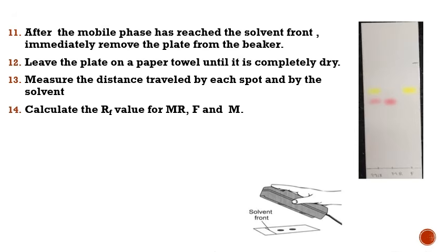Measure the distance traveled by each spot and by the solvent. And then, finally, calculate the RF values for each methyl red, fluorescein, and the mixture.